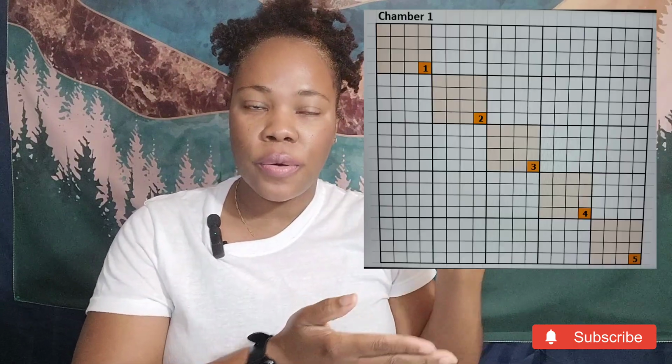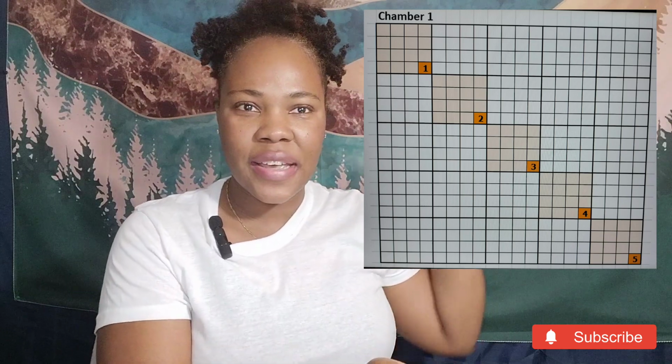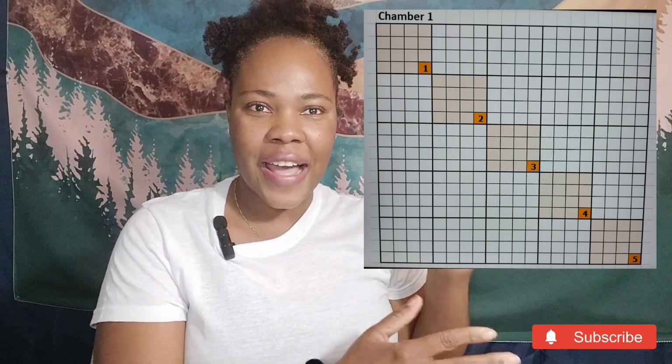And then in the lab, we've come up with our own method and rules for counting the cells. So you're not going to count all the cells in all the 25 squares. You want to choose 5 of the large ones and then select a number of the 16 small squares. So what I do in our lab is for chamber 1, we've decided to count on a diagonal. And so that will be the orange boxes that are highlighted.